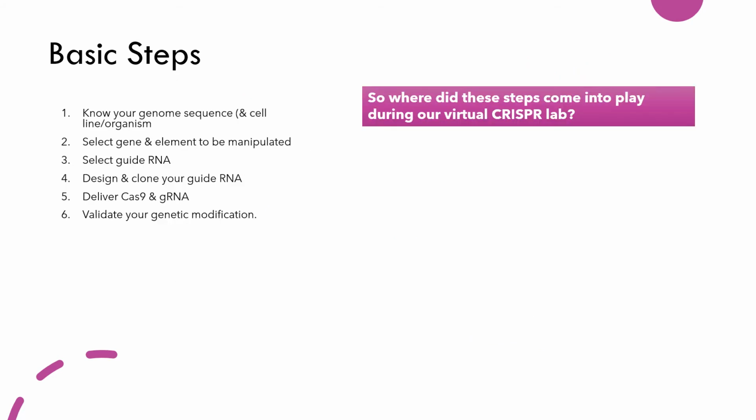Okay, so let's talk about that with specifics, with specific reference to what we were actually doing. What was our organism? Our organism is E. coli.